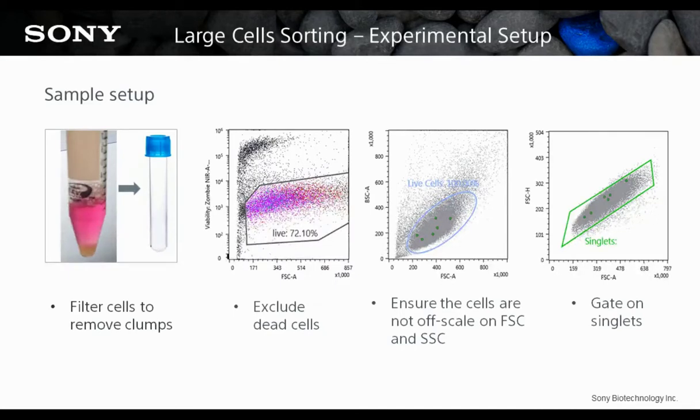Once the plate hardware is set, it is time to filter the cells and then preview and gate on live cells, making sure that your forward and side scatter detector voltages are set low enough not to miss any cells. One tip I can give is to start with a very low forward scatter setting and incrementally increase it until you see the main population outline. Another tip is to do a quick sort of the cell gate onto a glass slide to make sure that the cells are there instead of debris. Finally, for single-cell cloning, you must gate out doublets.